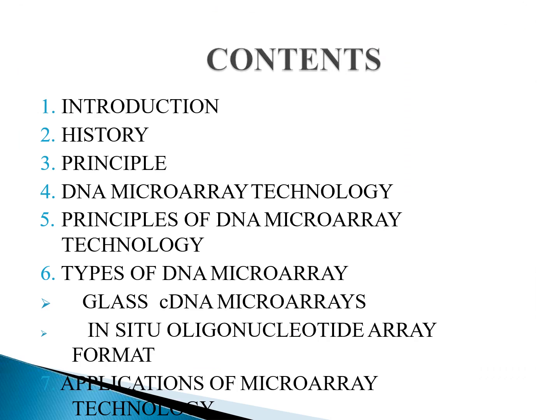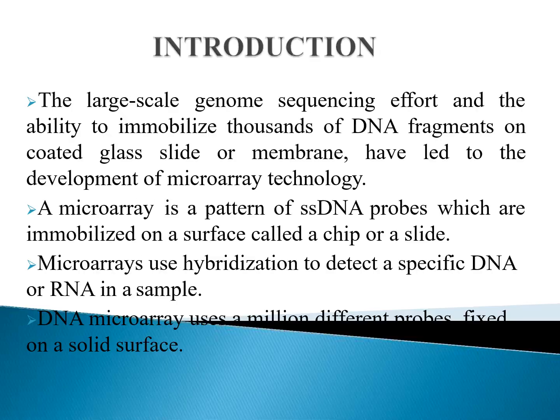So the contents of this lecture are introduction to DNA microarray, its brief history, then the principle of DNA microarray technology, that is how it works, how it functions. Then two types of DNA microarrays we are going to discuss in detail, that is the glass cDNA microarrays and in situ oligonucleotide array formats. And finally, we will discuss applications of microarray technology.